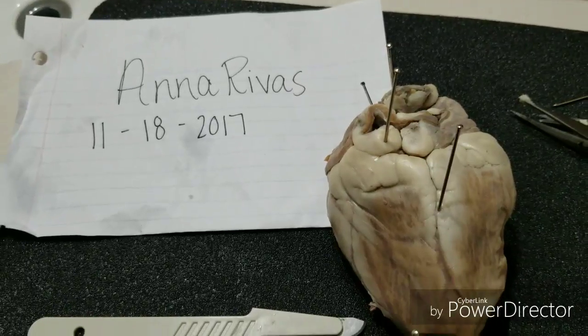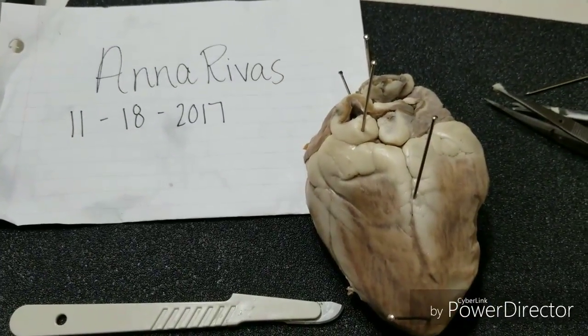I have already dissected my sheep's heart, so in this video we are going to be reviewing some structures both on the superficial posterior side of the heart as well as some structures that are found more deep to the heart. So let's start with the posterior superficial parts of the heart. You're going to begin by labeling some superficial structures of the heart.